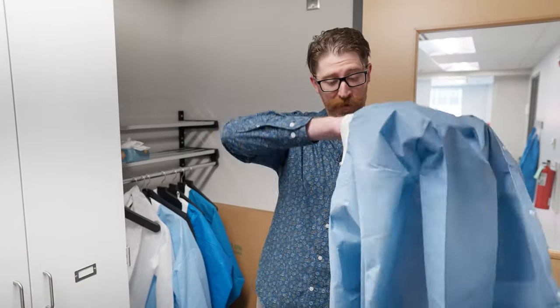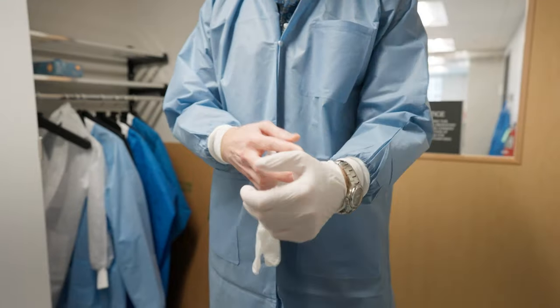But before we go into the lab, we have to put on personal protective equipment and that is going to protect us from the evidence and the evidence from us. Normally, I would wear a face mask, but we're going to take special considerations today where I will not have to wear a face mask.